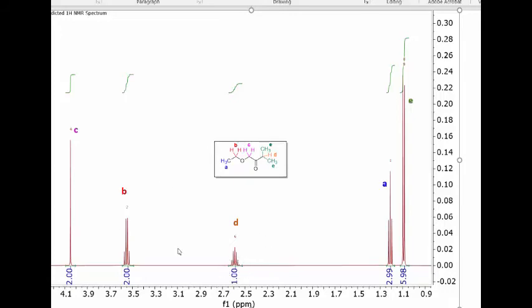But again, there's a substantial amount of power to being able to do predictions based on nothing but integration and chemical shift. Now, of course, the caveat here is that this is just an NMR prediction software as opposed to the actual spectrum. But I would imagine that the actual spectrum would be rather similar to this, although perhaps the chemical shifts would be off by 1/10 or 2/10 in any direction, something like that.